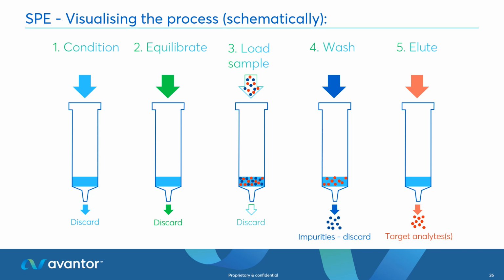The bulk of the surface area is within the pores. If we don't wet the cartridge appropriately, and what we mean by wetting is getting liquid into the pores, then it means that we lose the bulk of the surface area, which means that we'll overload the cartridges, the phase, very easily. We can do this in a variety of ways.